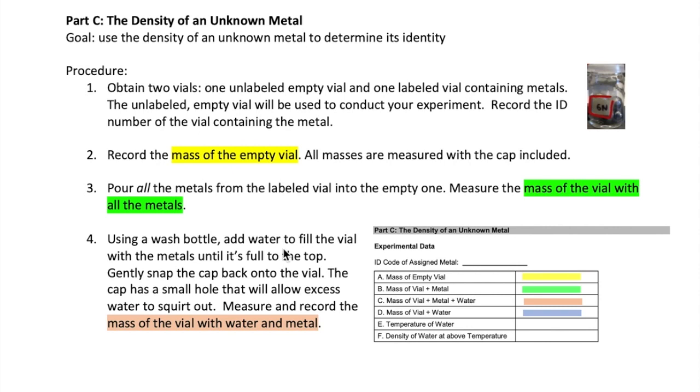Now, using a wash bottle, add water to the vial that has the metal in it until it's completely full to the top. Then gently snap the cap back on. Some of the water may squirt out of a small hole in the cap. This is okay. You just want to make sure that the water is full to the top. Dry the outside of the vial with a paper towel. Then record the mass of the vial with the metal and water inside in this spot right here.